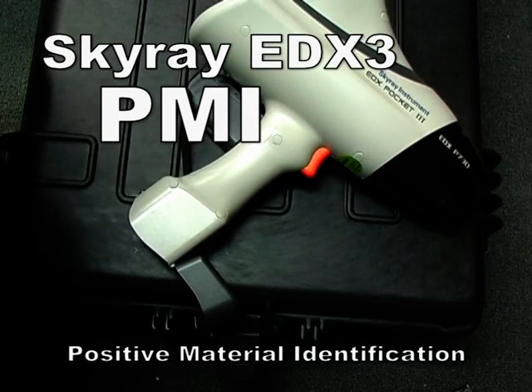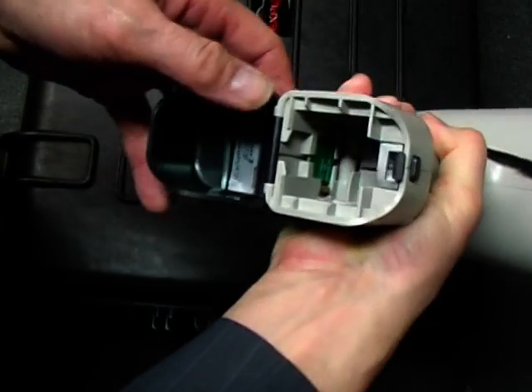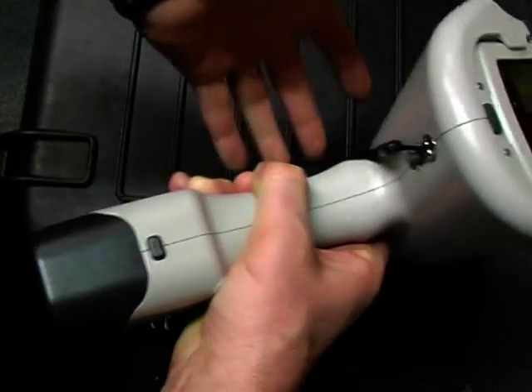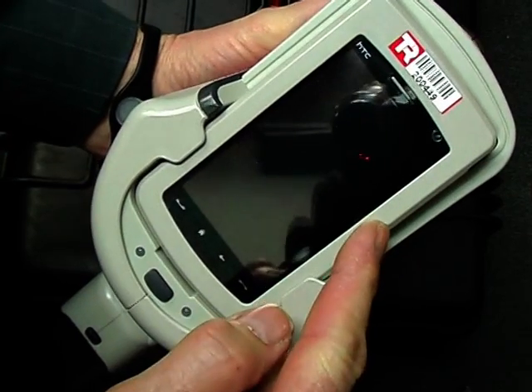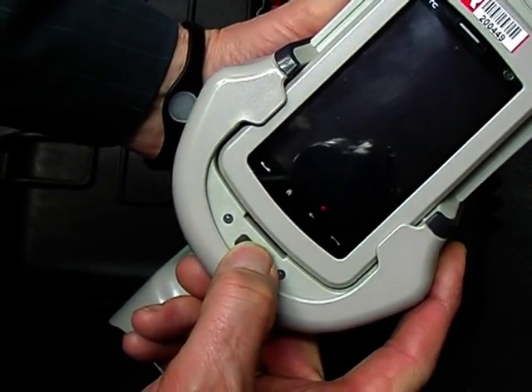I'll now demonstrate using the Skyray EDX3 to test an alloy sample. Firstly, we need to insert the battery. Note that the PDA also needs to be charged up occasionally, so if you're using it over a day, the battery in this does last around a day.